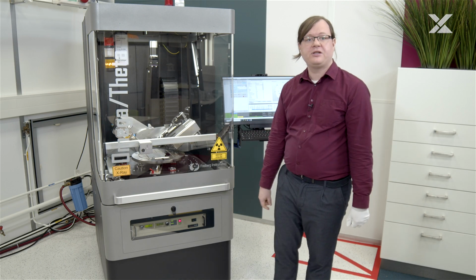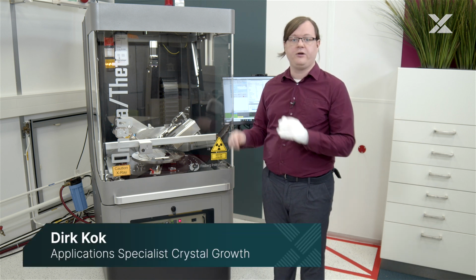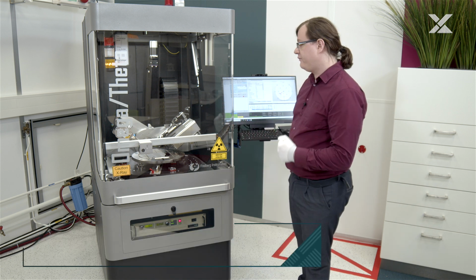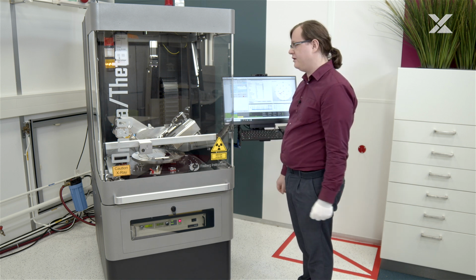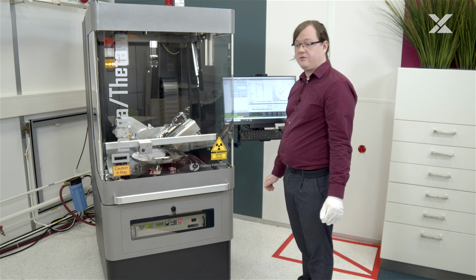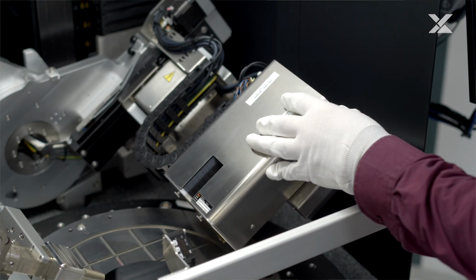Welcome everyone. Today I'm going to show you how to record a theta scan and a rocking curve on our Omega Theta. I've gone ahead and placed a silicon wafer in the system, and I've done the height alignment and already placed the tube in the theta position, so it's now moved back.